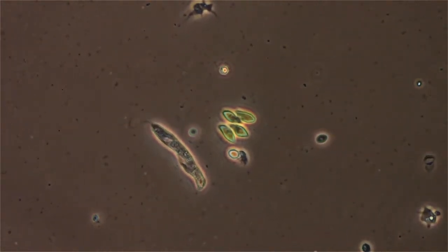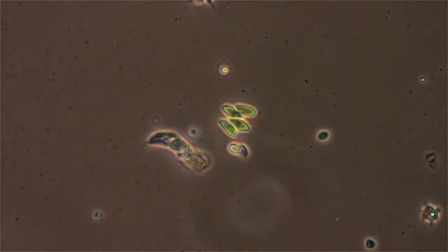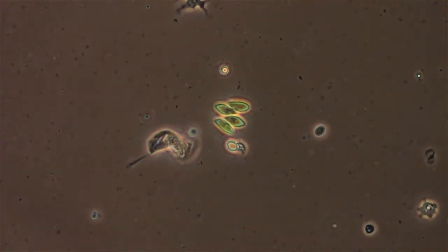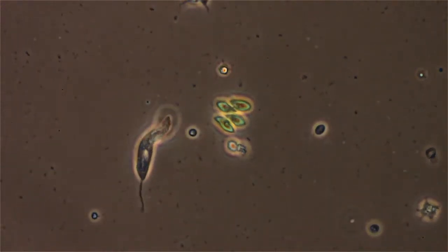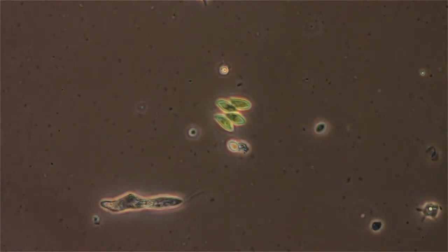More algae. I don't know what kind. More amoebas down there in the right corner. More peronema.